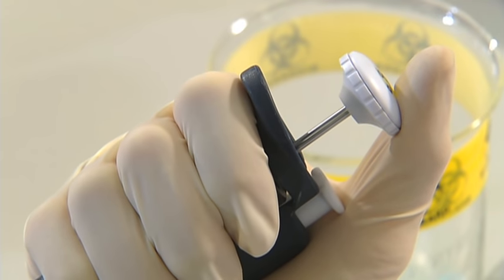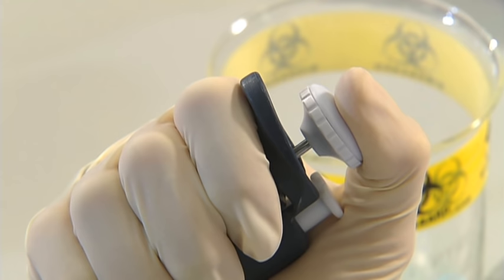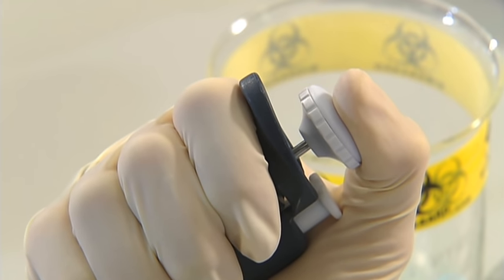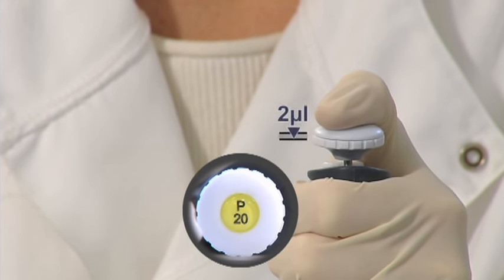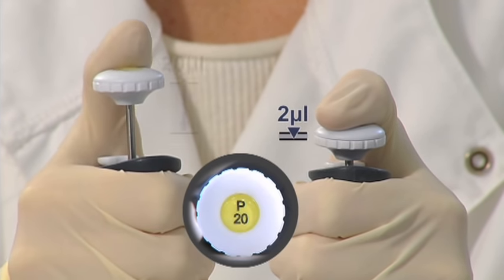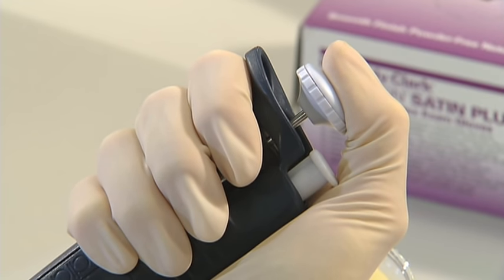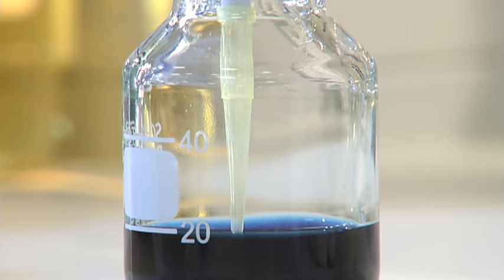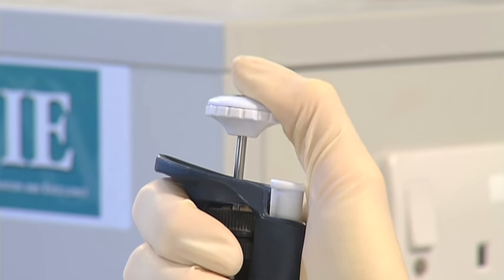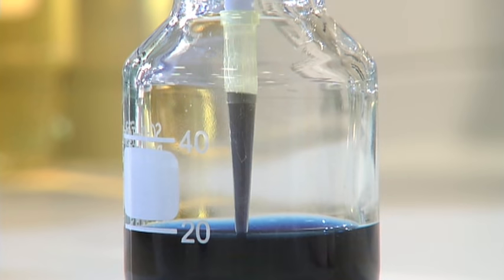Liquid is drawn in and expelled using the pipette's push button. Gently apply pressure to the button with your thumb until you feel a natural stop — this is called the first stop. The distance you push will vary depending on the volume required. To use the pipette, push the button down to the first stop, then, keeping the push button at this level, place the pipette tip about two millimetres into the liquid you wish to draw up. Release the push button slowly, then pause for a second to ensure all the required volume has been taken up — this is especially important for more viscous liquids.